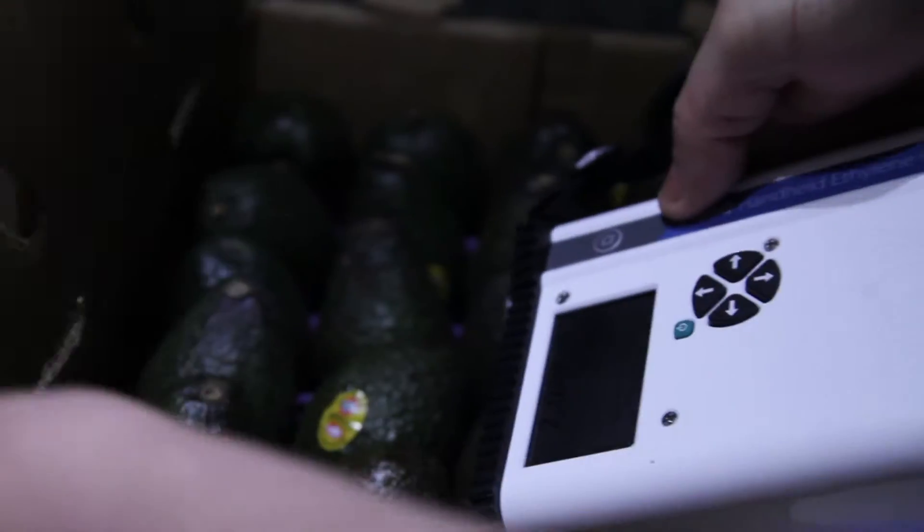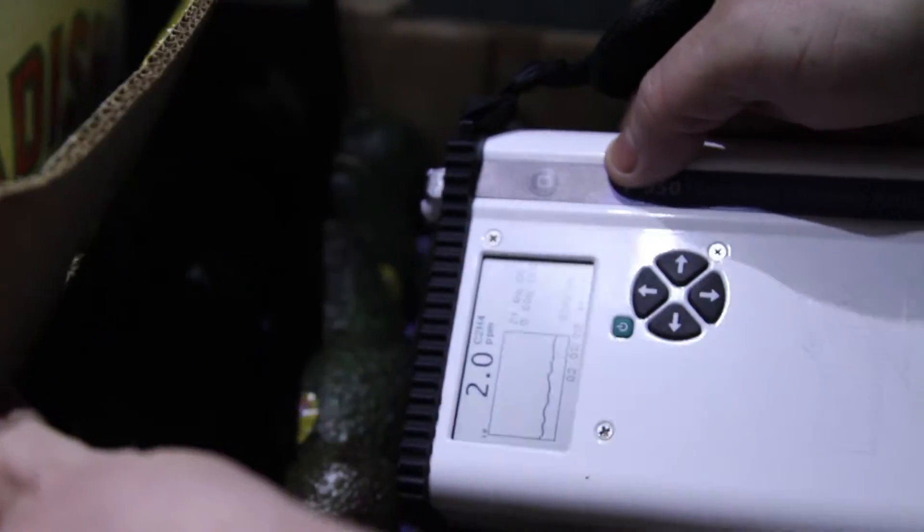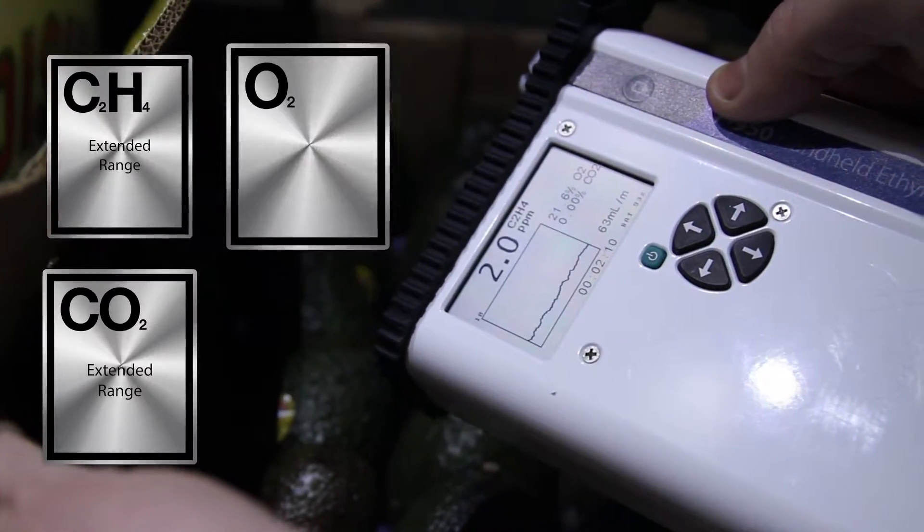Simple to operate and weighing less than one kilogram, the F950 records ethylene, carbon dioxide, and oxygen concentrations as well as date, time, relative humidity, and GPS location.